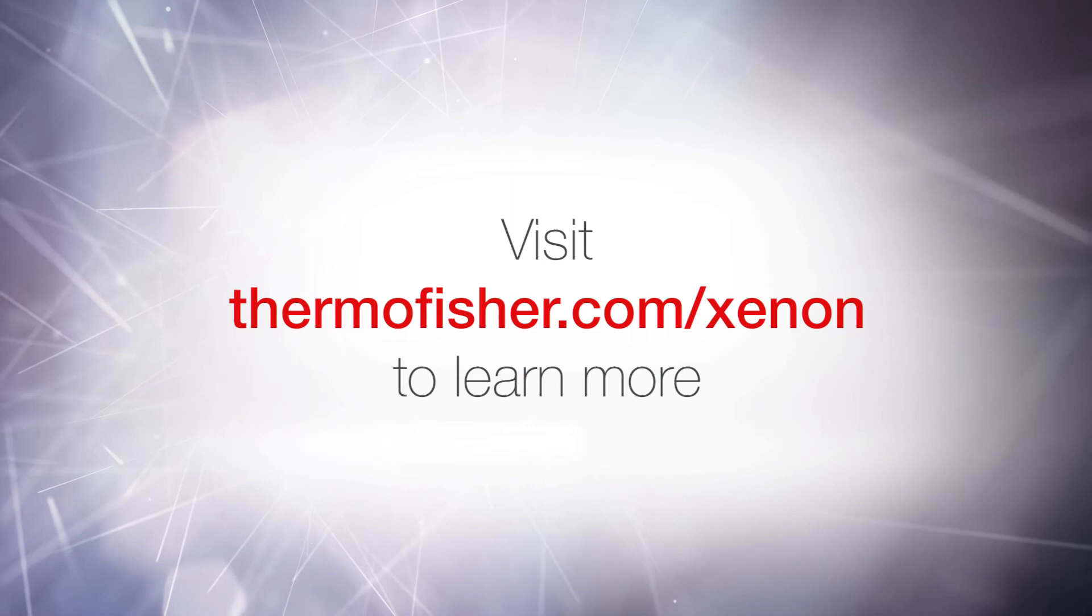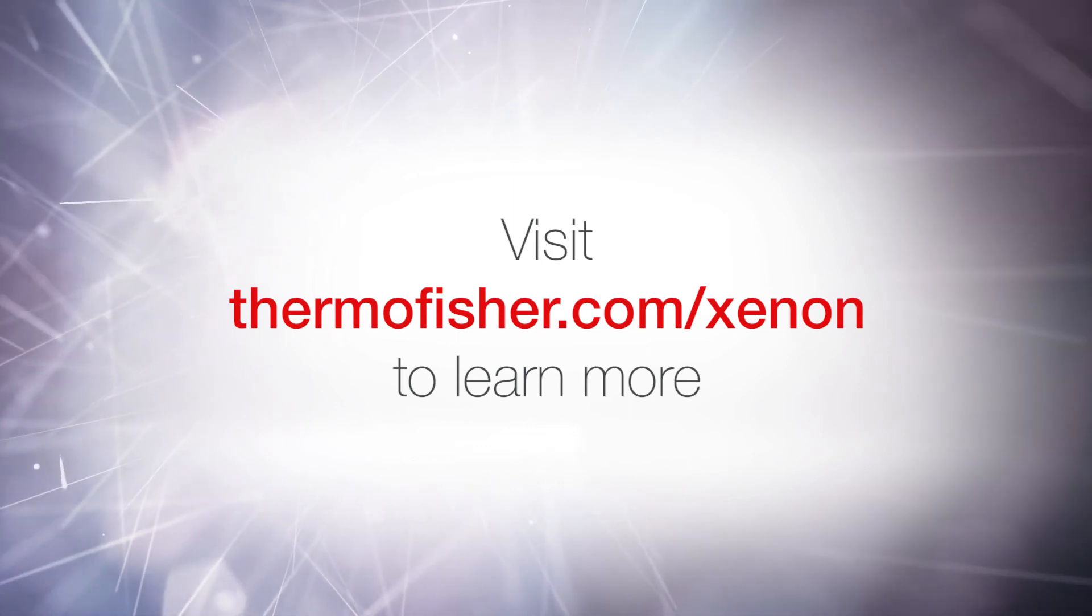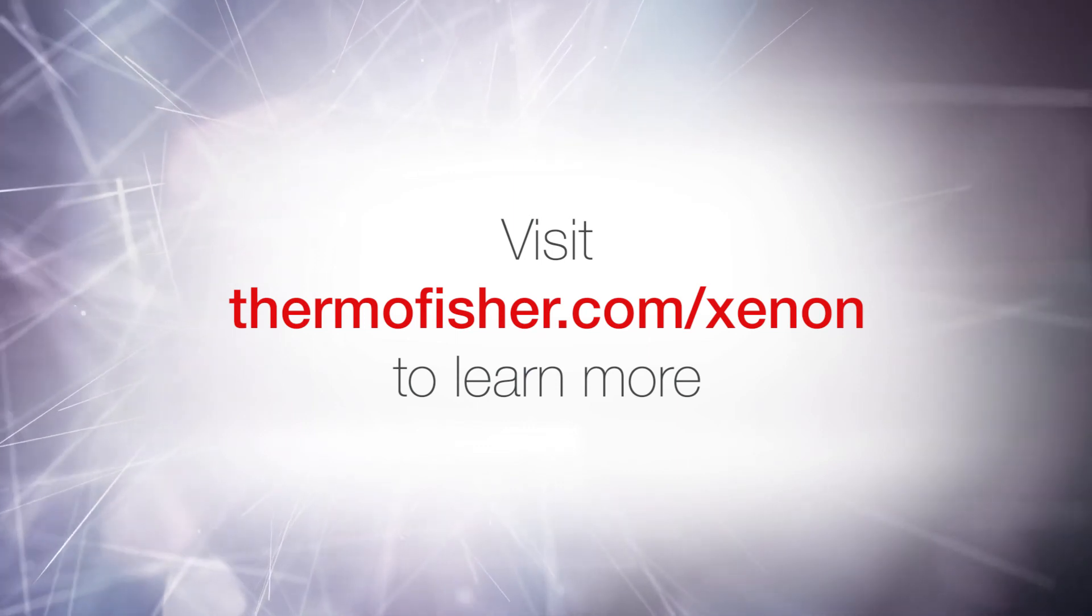Visit thermofisher.com/xenon to learn how the Gibco CTS Xenon Electroporation System can help streamline your cell therapy development.